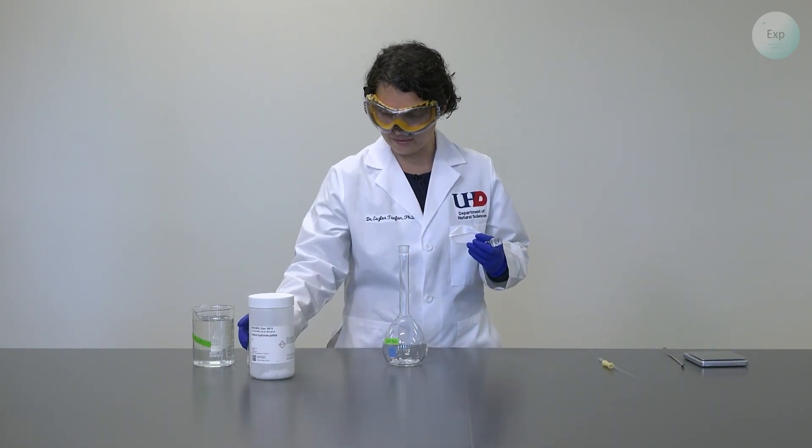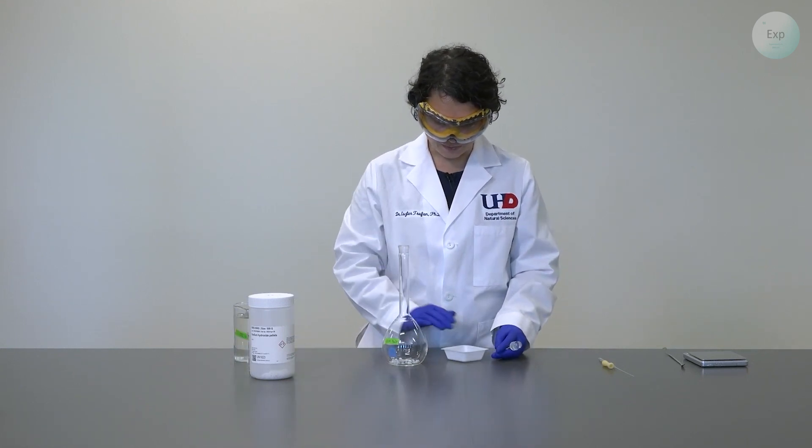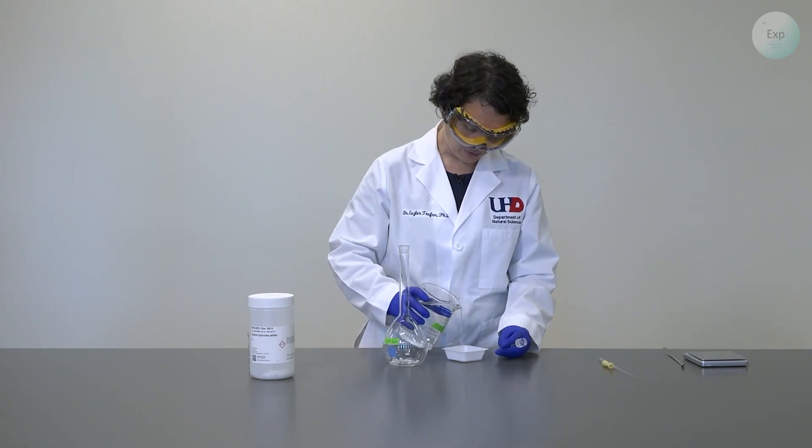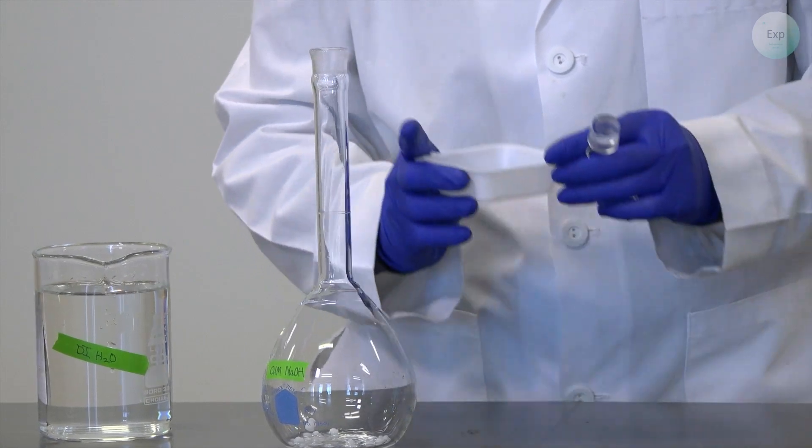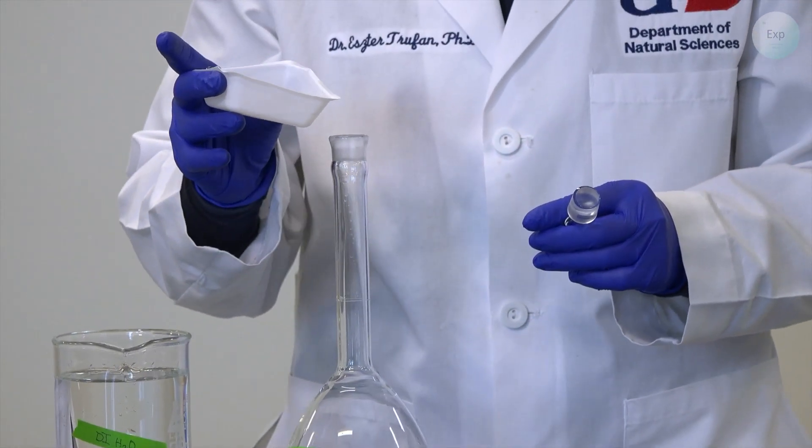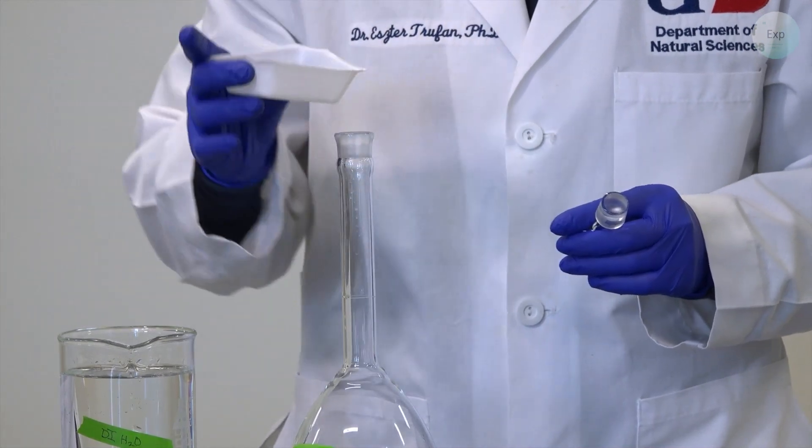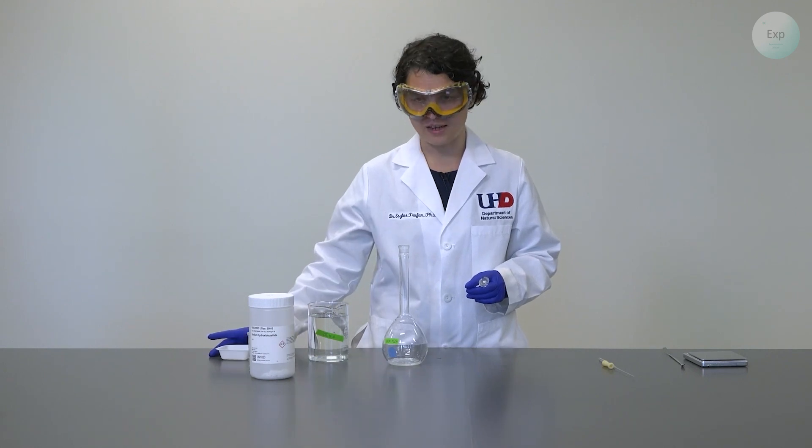Next, I'm going to bring in my deionized water. Because there may be traces of the sodium hydroxide on the weighing boat, I will add a small amount of water to it. This will allow any stuck-on residue to dissolve and transfer into the volumetric flask. My weighing boat is completely clean now, and I can set it aside.